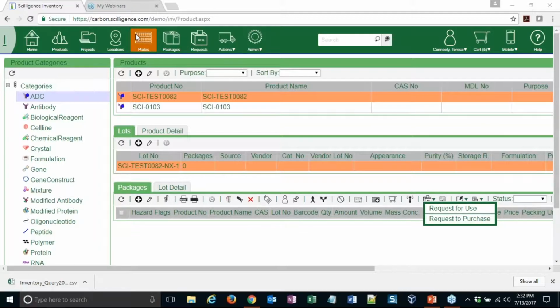Oh, if you can order plates as an inventory, yes, sorry. Office supplies, laboratory supplies, yes, you could just add them here into your system. And for example, if you enter them into the products, then you'd have all the information there to reorder. Yes, sorry about that. I was just thinking about how to set up a plate.